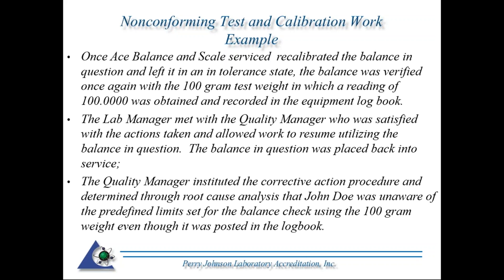They then re-verified it with their in-house weight. Everyone was satisfied. However, that's not to say this couldn't happen again. In other words, John Doe proceeded to utilize the balance when it was obviously out of predefined conditions.